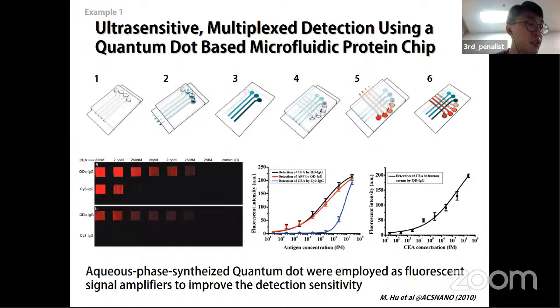Secondary antibodies were conjugated to luminescence quantum dots to realize a versatile fluorescence probe that could be used for multiplex detection in both sandwich and reverse phase immunoassay. And this paper shows it is selective enough to be directly used in serum. These protein chips thus combine the high throughput capability of the microfluidic network with the high selectivity and multicolor imaging available.